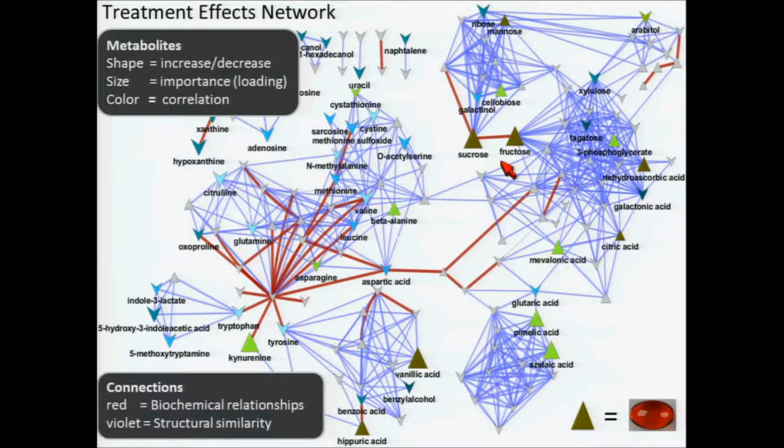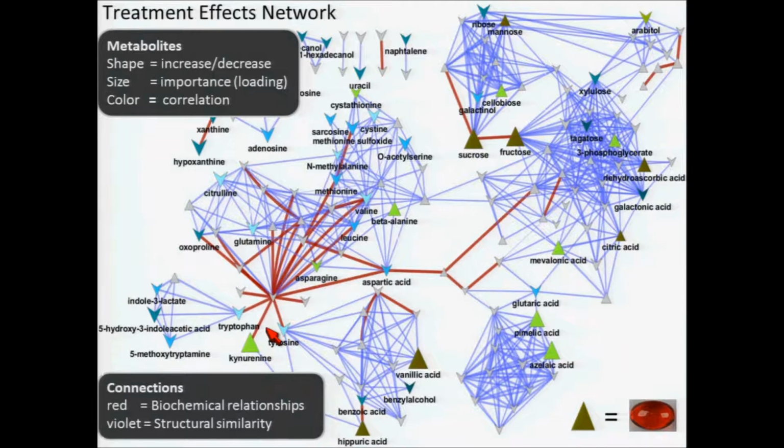Maybe something we want to look at is now the next biggest object. For instance, kynurenine. Kynurenine went up, and so now I want to know, what is it related to? I could look at the similarly correlated objects, or I can follow my network and see that it's a second edge neighbor to tryptophan. Kynurenine is going up, tryptophan is going down, and I also see many metabolites related to tryptophan also going down. Immediately, this gives me the hypothesis that maybe this drug is also impacting tryptophan metabolism. And as you can see, you can go on even further with this type of analysis.